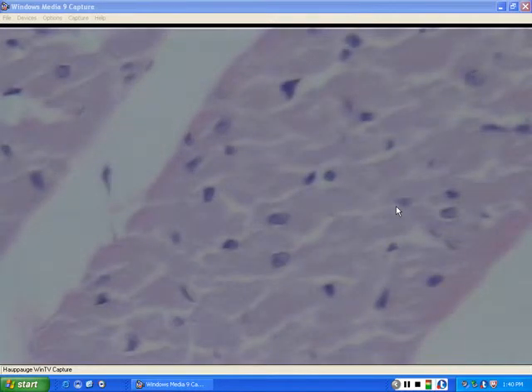The trick is trying to know it is a muscle. And this image here probably is the most definitive you'll see for it. The major locations for this muscle tissue, you'll find this in things like our intestines, our stomach, and forming the parts that actually ring and cause the movements of food throughout our stomach. So these guys are responsible for causing peristalsis and things like that in the esophagus and throughout the digestive system. These are involuntary muscles, so they're found a little everywhere, generally not the muscle that you generally eat.